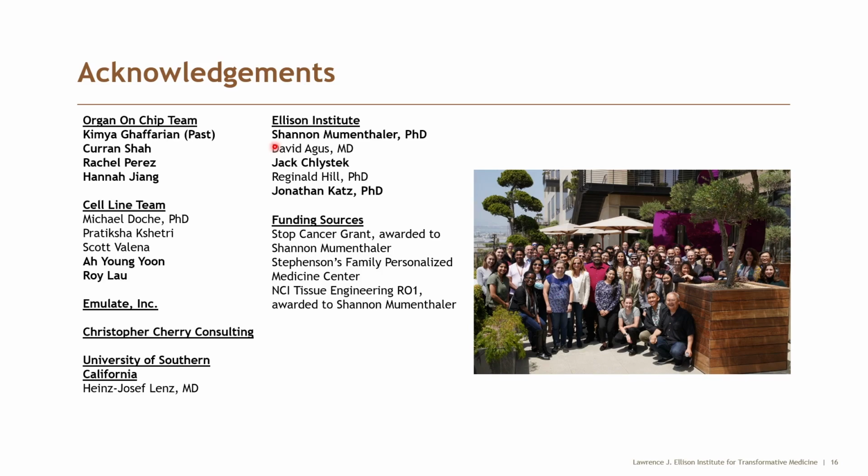I just have a question about how you plate your cells, because these are organoids that grow in 3D, but in your chip they're now in 2D. And when you look at your gene profiles, you see especially things like adhesion proteins and ECM proteins are now altered. So how closely do you actually think this is to in vivo tumor? Great question. Definitely one of the technical challenges of these organoids and getting them on chip. We do fragment them down quite a bit to get them on chip. So absolutely we are not able to really recreate the full 3D construction of the tumor. However, the benefits of all the crosstalk with the other cells seems to be important for us. So great point and important considerations.